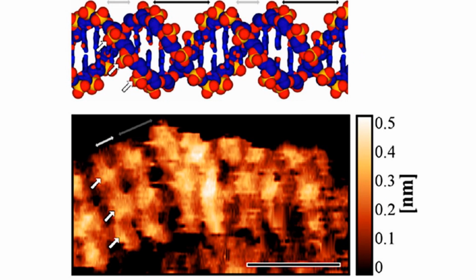Here's an AFM image of a DNA strand, so it's showing the actual double helical structure found within DNA. And again, AFM, atomic force microscope, so it's imaging the interaction between the atoms, and it's able to produce this false height image using false colors.